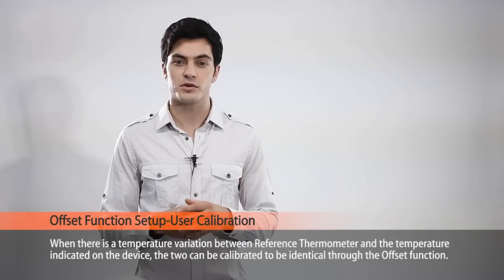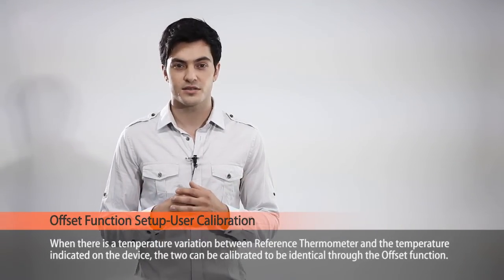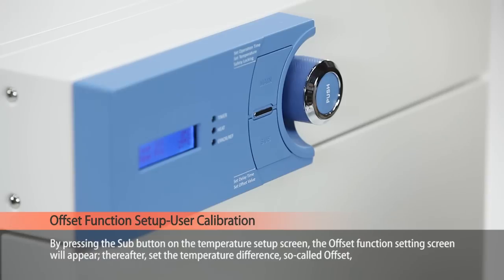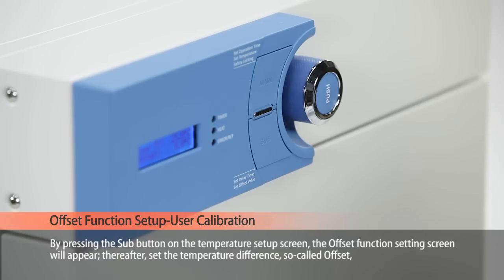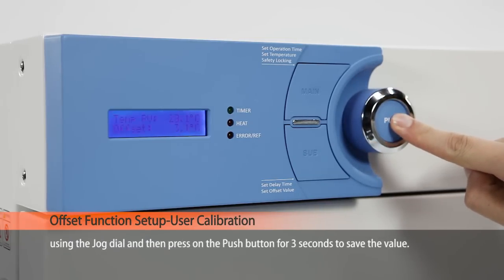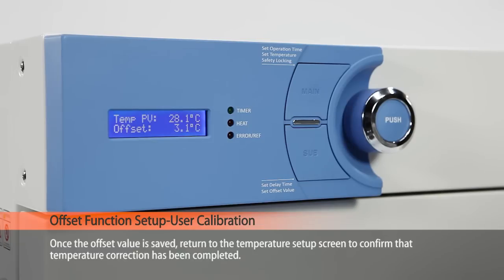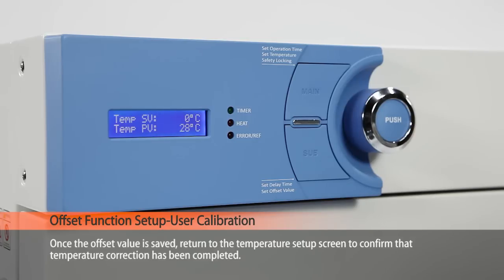When there is a temperature variation between a reference thermometer and the temperature indicated on the device, the two can be calibrated to be identical through the offset function. By pressing the sub button on the temperature setup screen, the offset function setting screen will appear. Set the temperature difference — the so-called offset — using the jog dial, and then press the push button for three seconds to save the value. Once the offset value is saved, return to the temperature setup screen to confirm that the temperature correction has been completed.